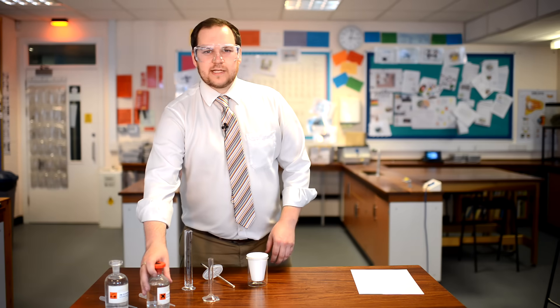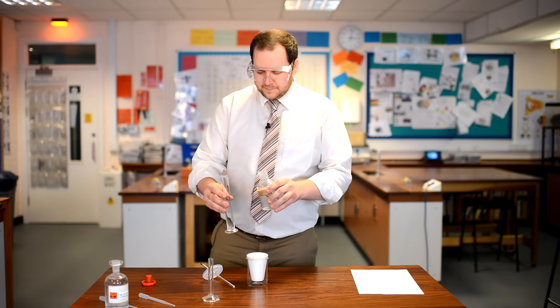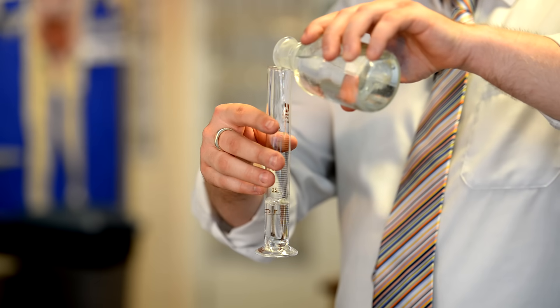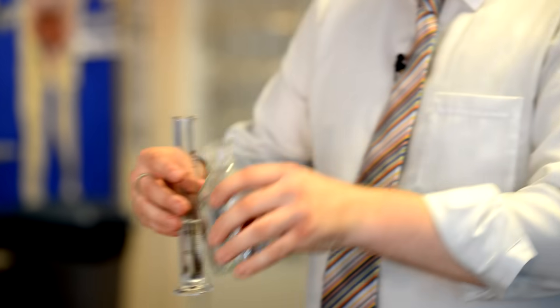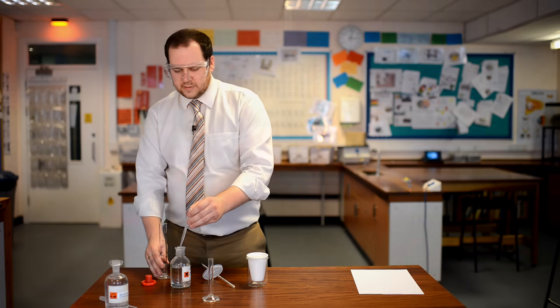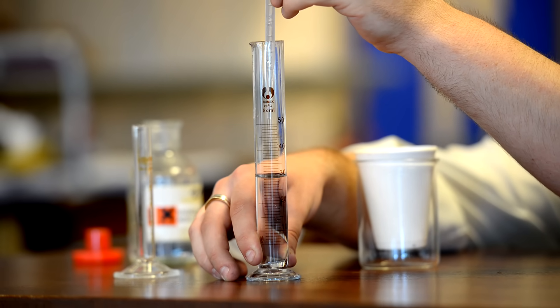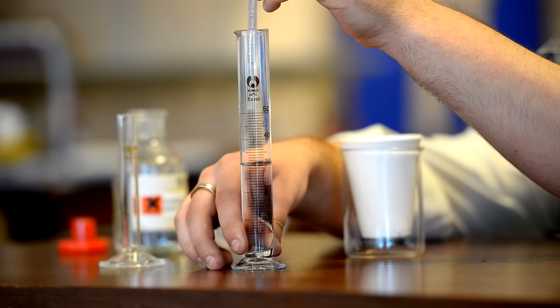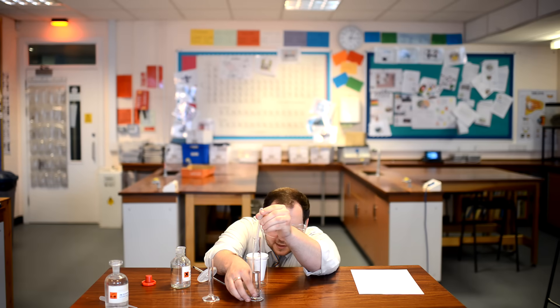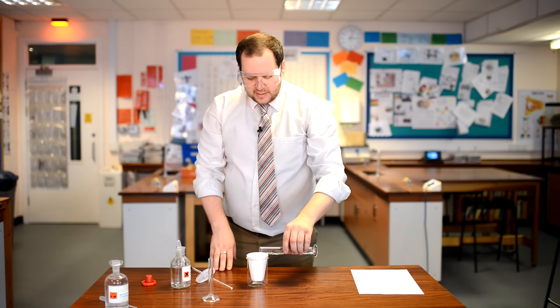First, take your hydrochloric acid and pour 30 centimetres cubed into the 50 centimetres cubed measuring cylinder. In order to get this precise, start off by getting close to 30ml but then finish off using a dropping pipette. I'm reading to the bottom of the meniscus.